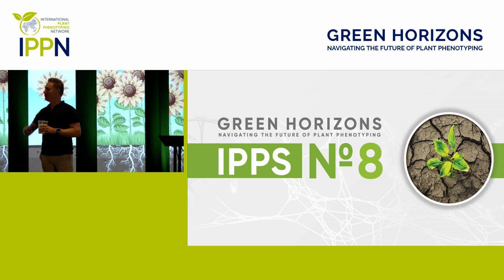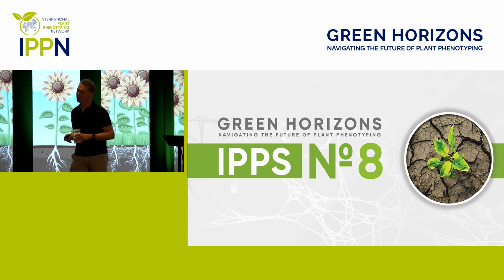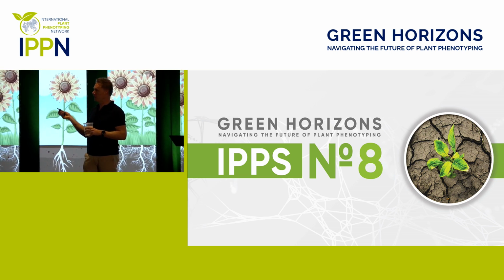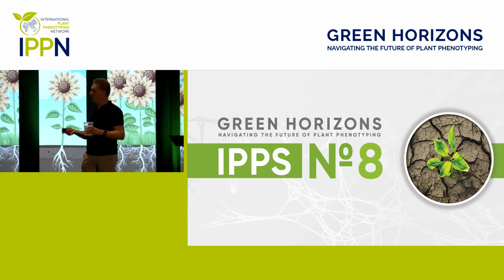Yeah, thank you for the question, because that's a question that many people have. Two answers. So you see the example of the breeder Strube. They are using it for routine screening for the germination testing. And before they made the final call in switching to this kind of testing, they did very rigorous testing to make absolutely sure that there is no effect caused by the X-ray radiation. So that was validated that way.